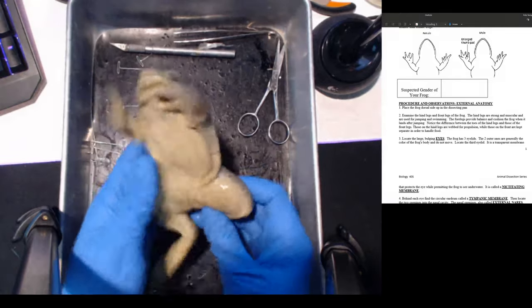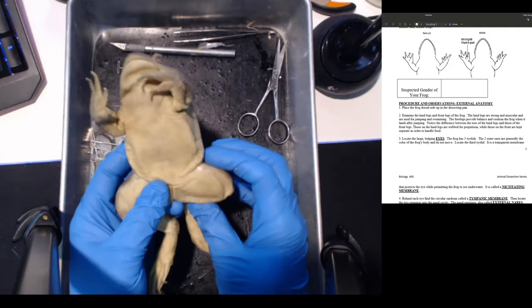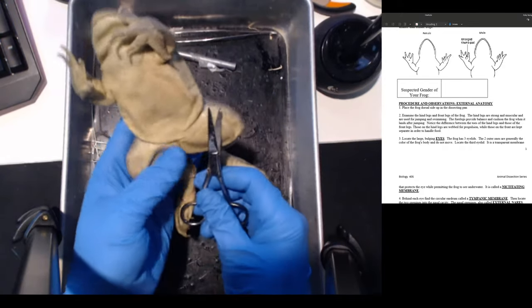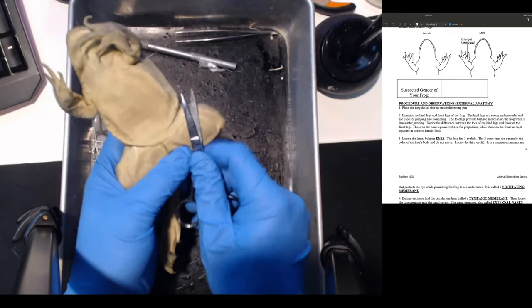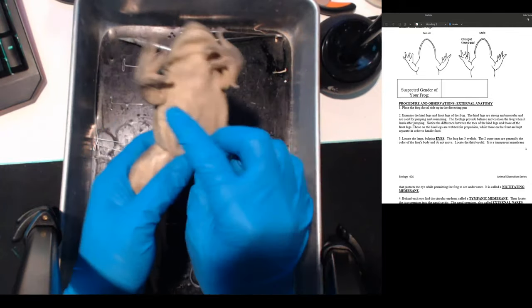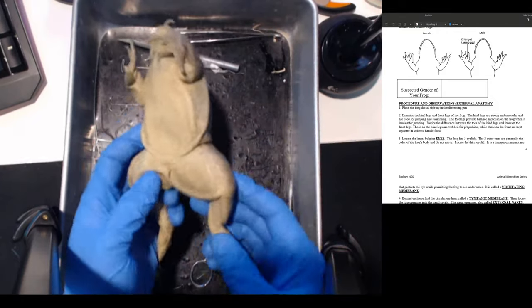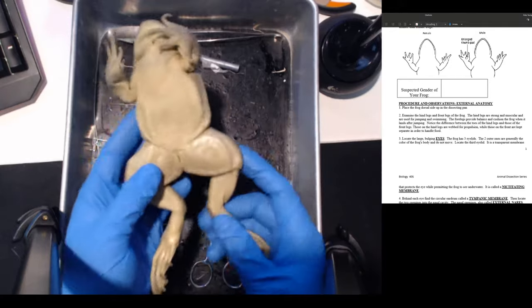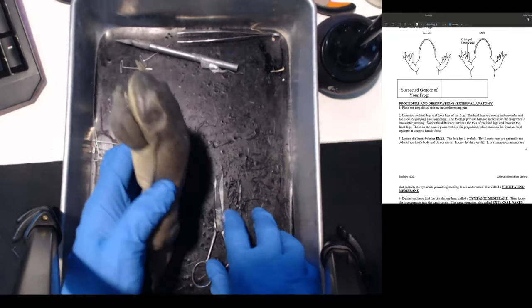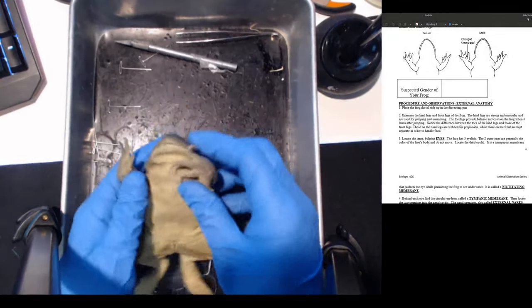The frog's hind legs are strong and muscular - frogs do most of their jumping and swimming with these massive legs. If you look at the proportion here, this is the thickness of the hind legs - it's almost across the entire abdomen. Imagine if our thighs were that size - we'd be pretty strong and think about the size of this leg compared to the rest of the body.